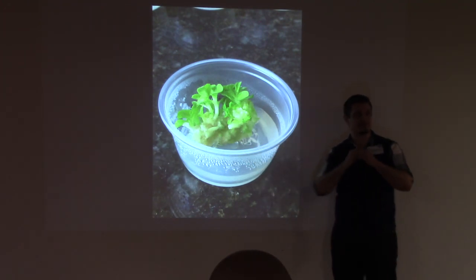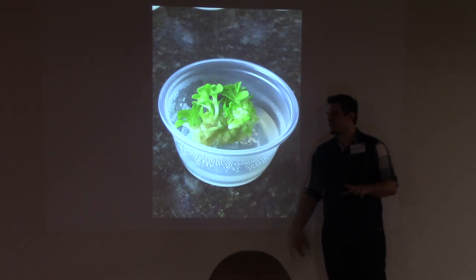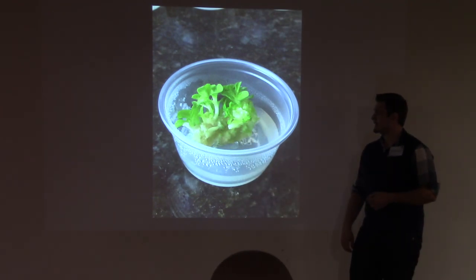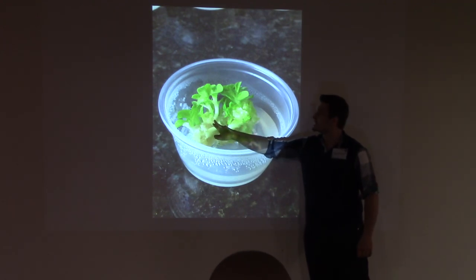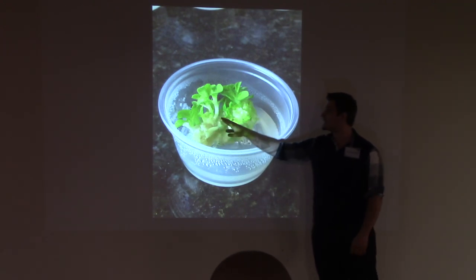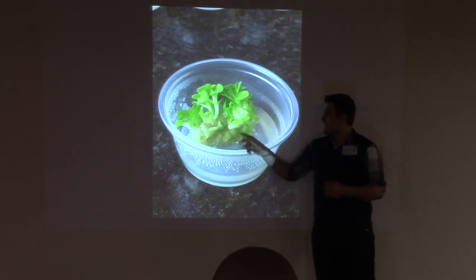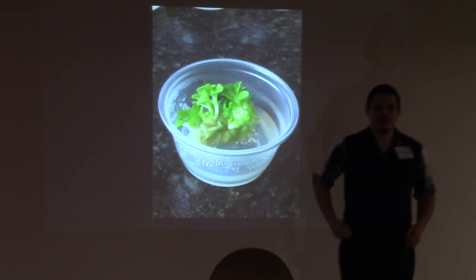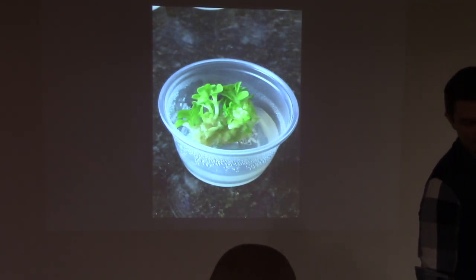The hormone itself diffuses throughout the entire tissue. So randomly, and it almost is truly random, I kind of want to do an investigation on that, but basically, whatever cell is the most viable actually starts to produce a shoot and grow out of it. So this is basically everything that a plant is minus the roots. So with the scalpel, you just cut that part off, and you put it in media containing rooting hormone. So the rooting hormone is higher than the shooting hormone.